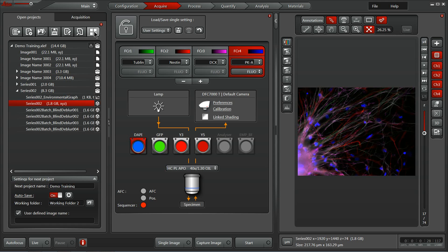This top right button will activate a gallery view, which is a quick way of jumping to exactly the image you wanted instead of having to click on each one — you can see them all displayed together.